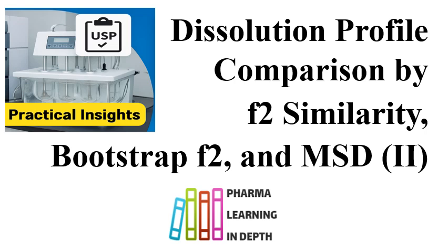Also, these comparison techniques are used to demonstrate the product dissolution before change and after change, that is SUPAC.